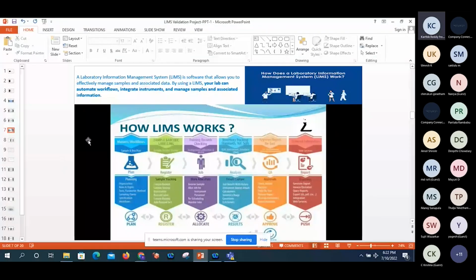So here, if you are seeing, there is master data. I already explained to you guys about the master and what is important. Master workflows, when completed, the people who can do that is planning related, like writes, tests, sample points, sampling points, everything. I already explained about the barcode label, like how once a sample is generated in LIMS, how we can take the barcode, and how barcode labels affect sample tracking.